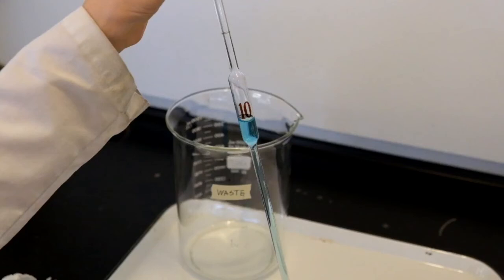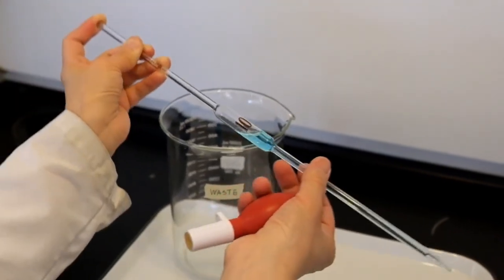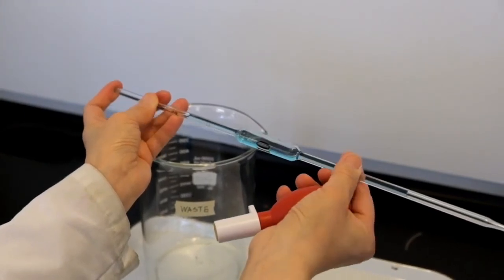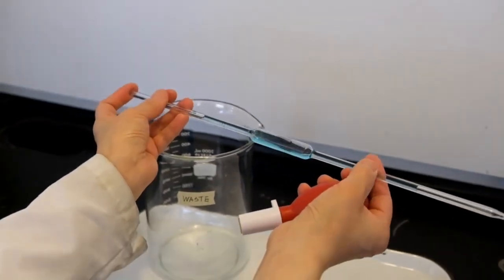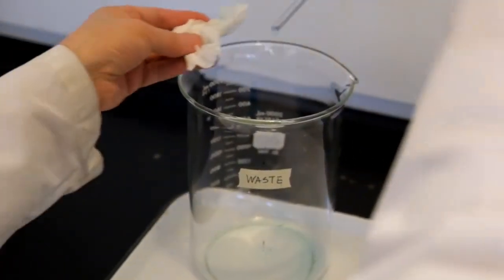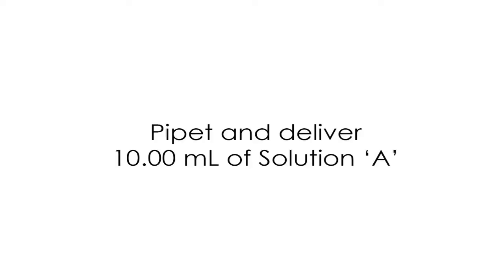For acclimatization, we draw up a small amount of the solution, about 1/3 to 1/2 of the bulb of the pipette. Remove the bulb and tilt the pipette horizontally to rinse the inner walls of the pipette. Make sure to let the solution slide past the calibration mark near the top of the pipette and rotate the pipette to ensure the solution touches the inner walls of the pipette. Drain the solution completely. After draining all the solution used in the acclimatization, dry the top of the pipette thoroughly, and repeat this step 3 times to finish acclimatizing the pipette.